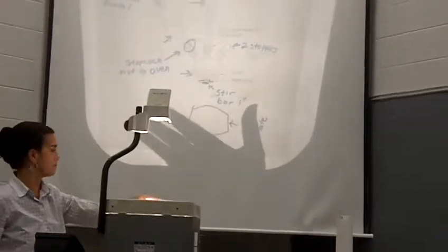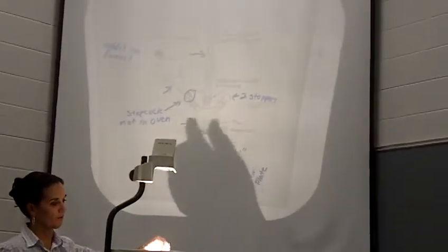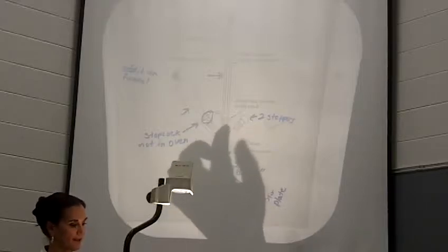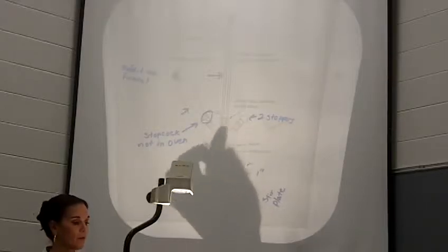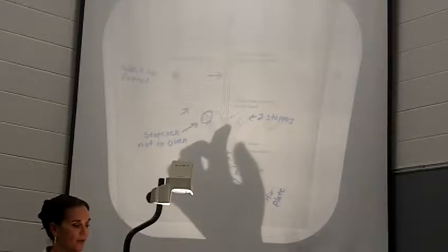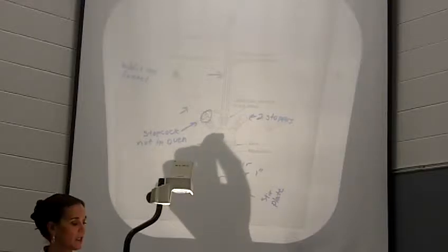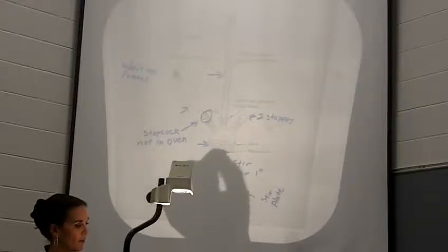Now, the apparatus that you're going to use this week for forming the Grignard reagent and then doing the Grignard synthesis is this guy here. So you're going to use your 3-neck flask. This is kind of the one and only time, unless you go on and do Chem 256B, if you do the independent project. So you'll use your 3-neck flask. That's why you cleaned it last week. You'll have your stir bar in there.